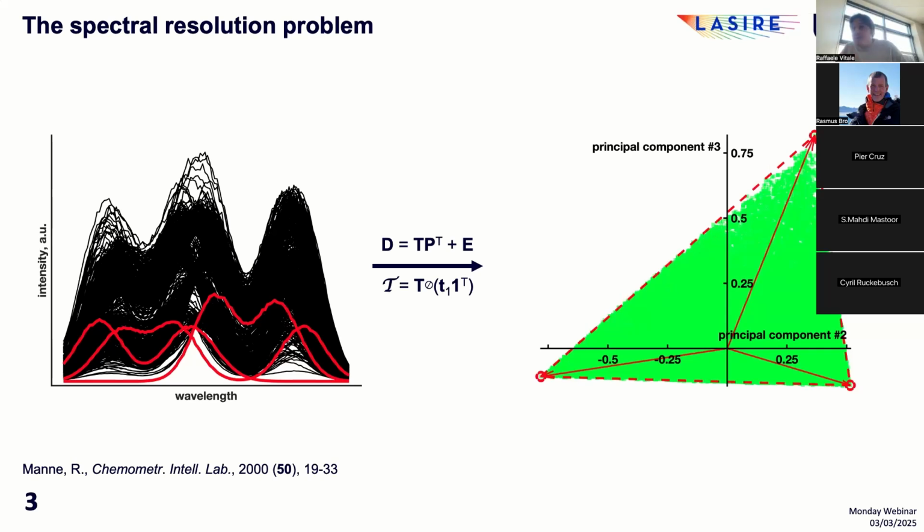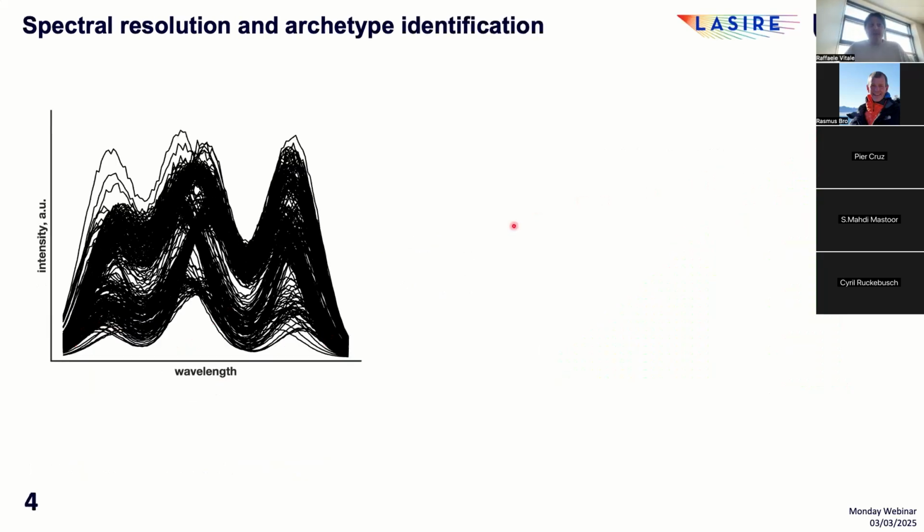However, contrary to this ideal situation in which pure selective information is available, in which pure samples were collected, well, life may be slightly harsher. Why? Because most, if not all, spectroscopy experiments conducted on real-life systems lead to the generation of extremely redundant data.